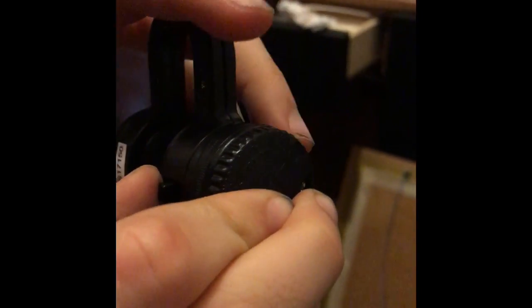Microscope for your phone. So you just peel this back and slide it, and then slide it in. Boom shakalaka, someone call the doctor. And then you can get it on Amazon.